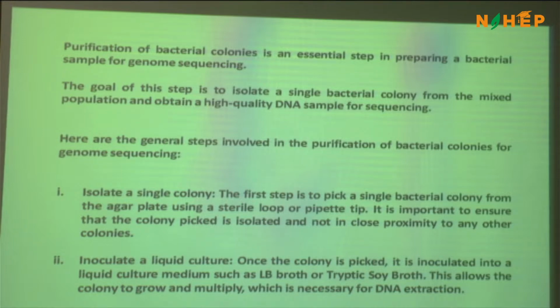So the best method, I always tell, the third and fourth quarter should give you at least 20 independent colonies, at least. If you can do that, you are well set for handling bacteria, right? And how to do that? Anybody? It's very, very basic.